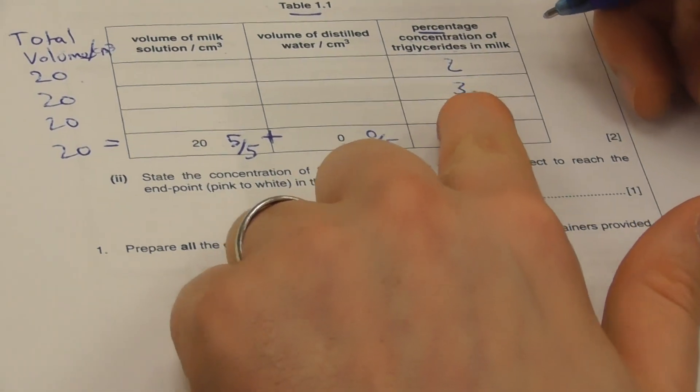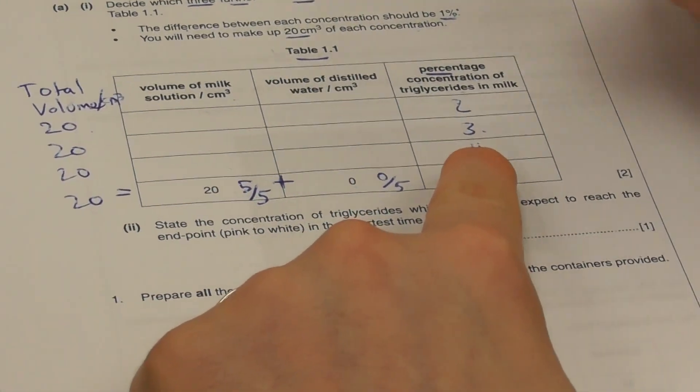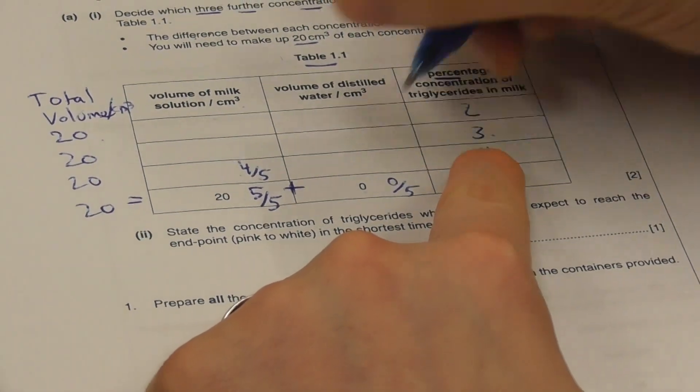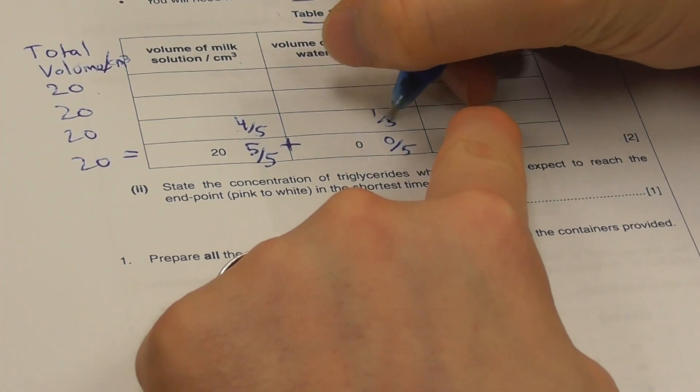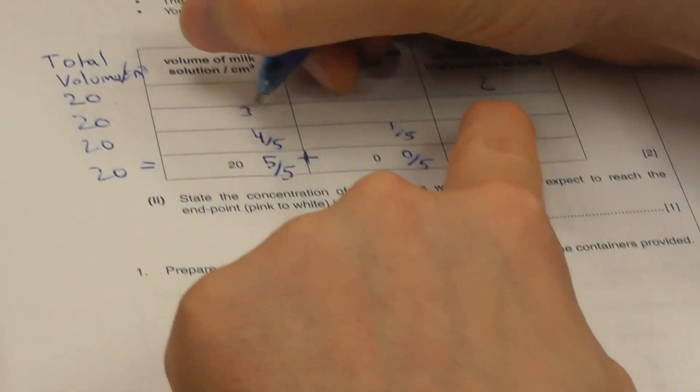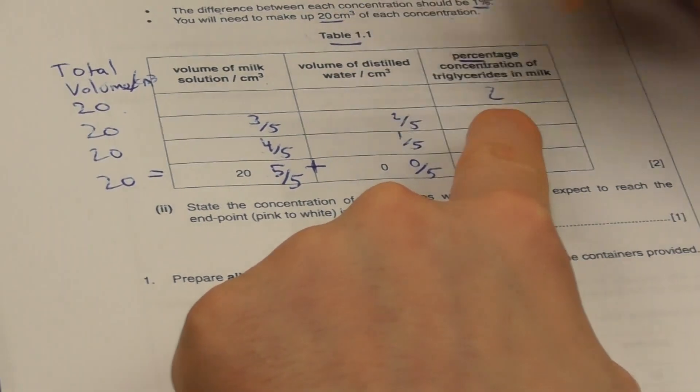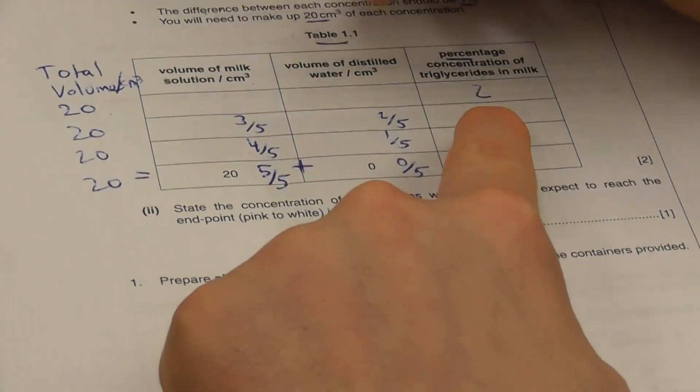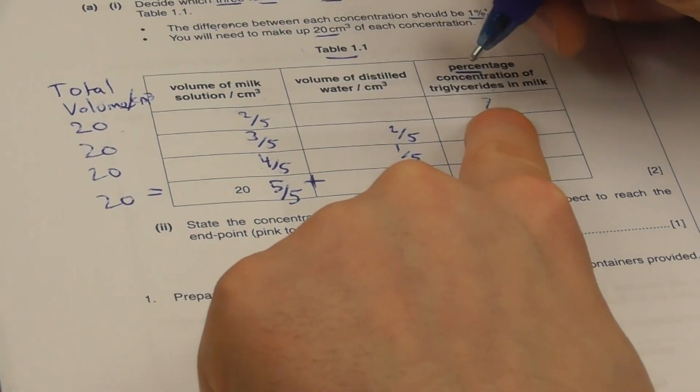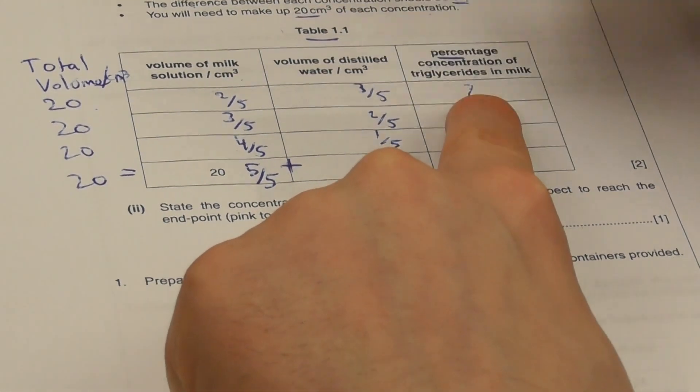In 4% triglyceride, 4 of those parts are going to need to be milk and 1 of those parts are going to need to be water. The same is true for 3%. 3 of those parts are going to need to be milk and 2 of those parts are going to need to be water. And the same is true for 2. 2 of those parts are going to need to be milk and 3 of those parts are going to need to be water.